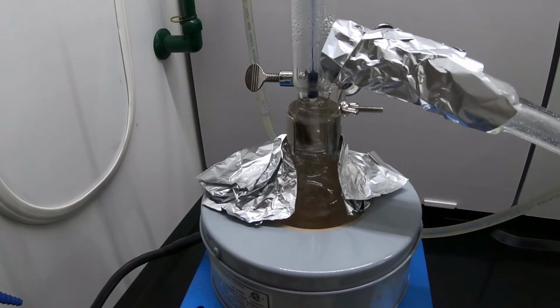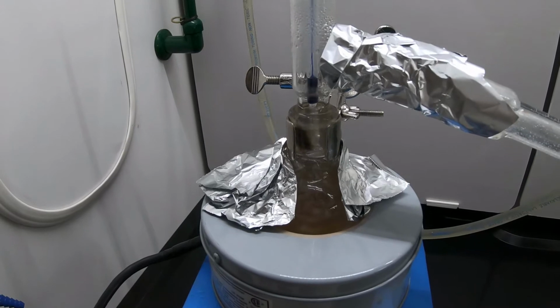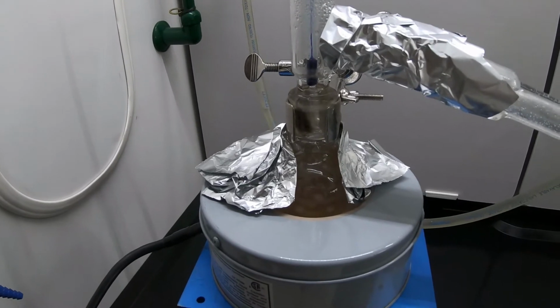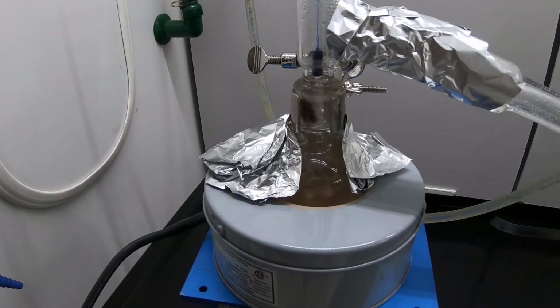Without boiling chips, we say the material bumps, and that means very large bubbles form, and this whole thing tends to almost erupt. Here with the boiling chips, large surface area, we get very smooth boiling and very nice condensation of material.